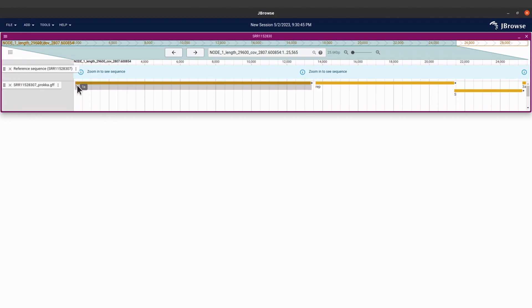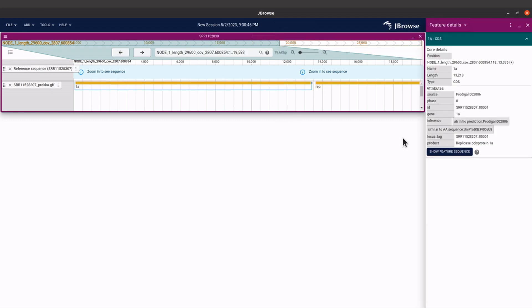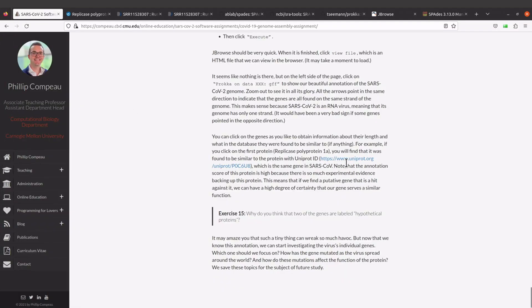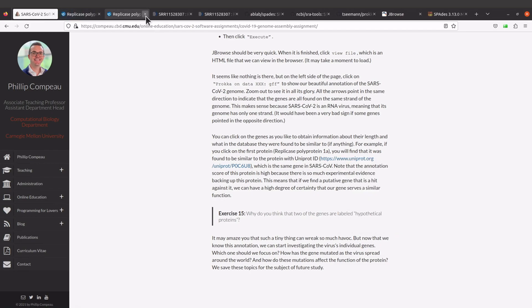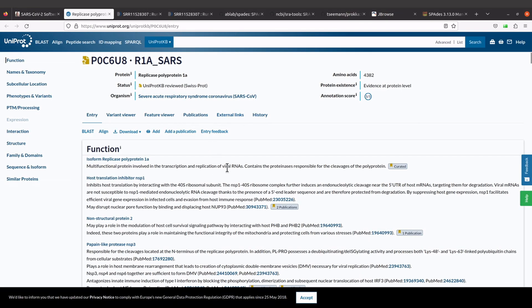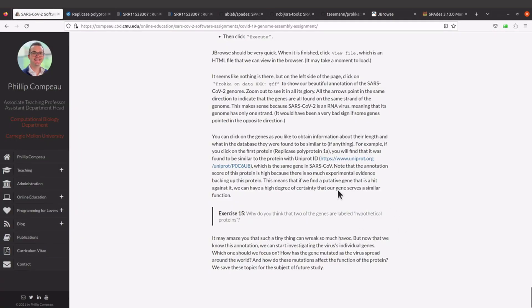When we click it we are going to find this coming up. You can check the statement — we have the name, length, type CDS, etc. This is what the tutorial is referring to: it says it's similar to a sequence from UniProt KB, and we have the ID here. Once you see this, you can look up that protein and find out more information because the accession number has been given. The tutorial page gives out the link so you can click it to open it, and there's a page where you can read more about that particular protein.